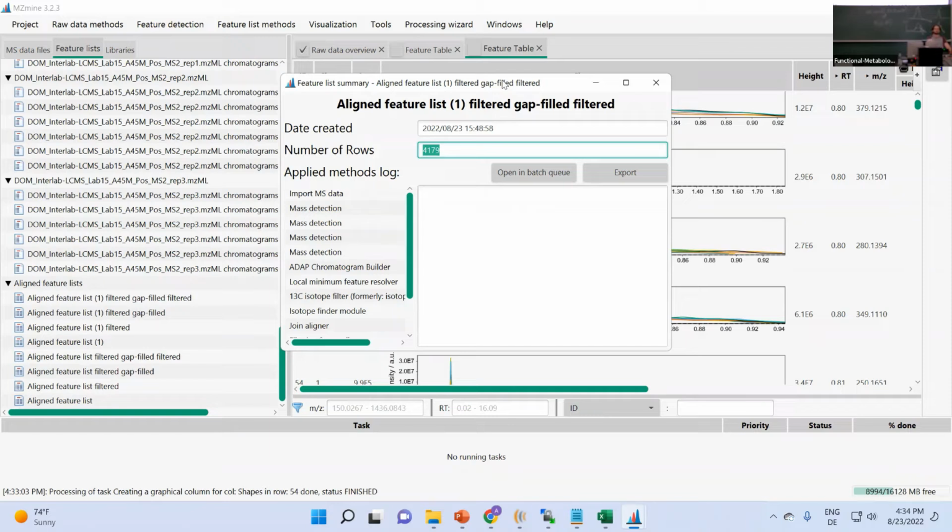But this was fixed once we went into the batch mode and saw that just one parameter was not 5E5, but just 5. So sometimes it's easy things like that, right? But sometimes, because we have different data sets, we don't expect it to be the same, right? So that's the idea of this.